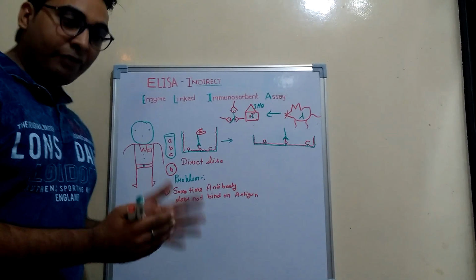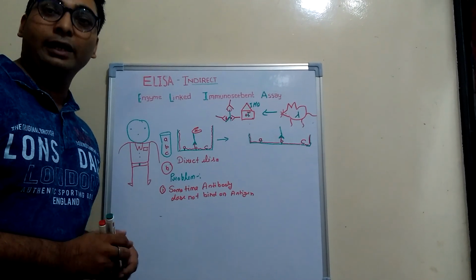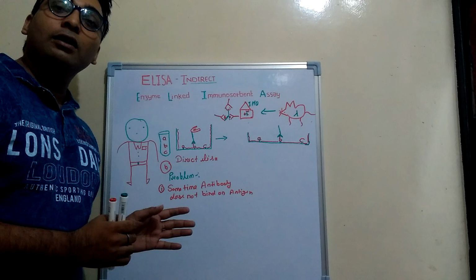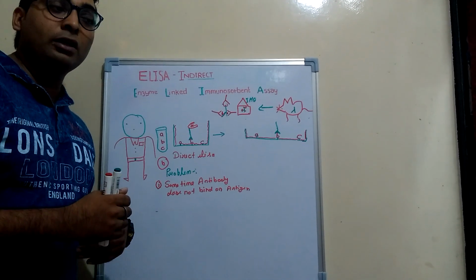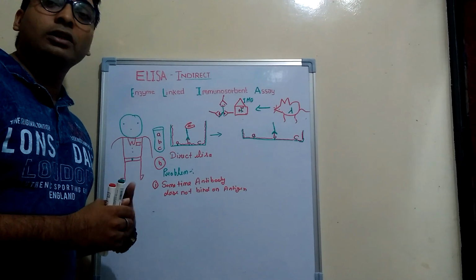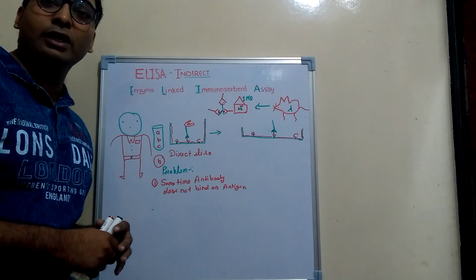Now, in my previous lecture, we discussed the direct ELISA. In that ELISA, we discussed the initial step of ELISA, where the scientists or designers were only designing the ELISA. That was the basic step of ELISA.